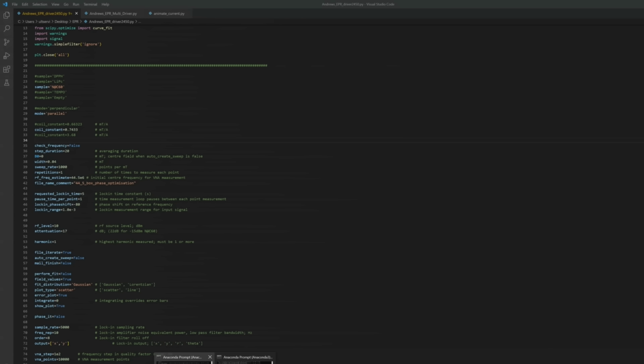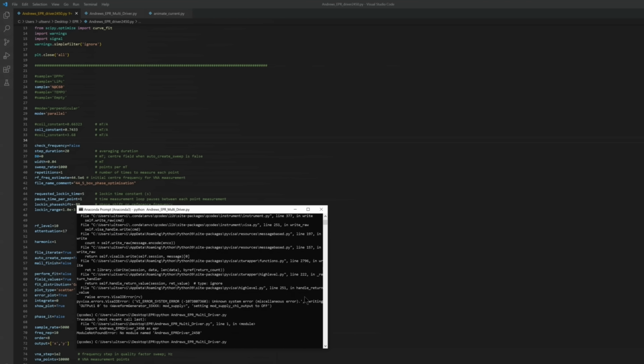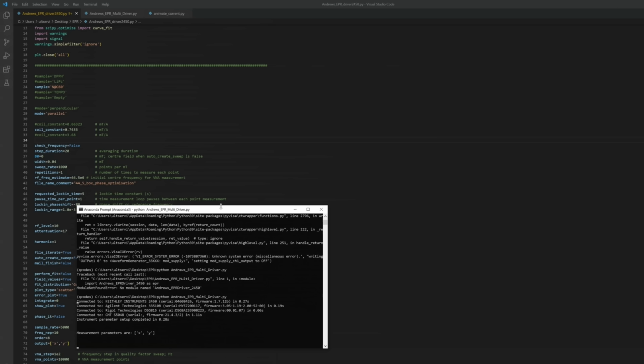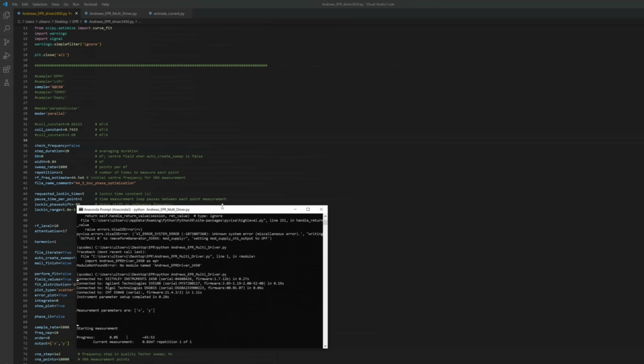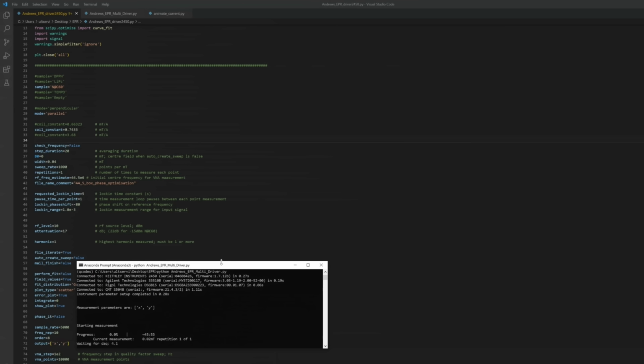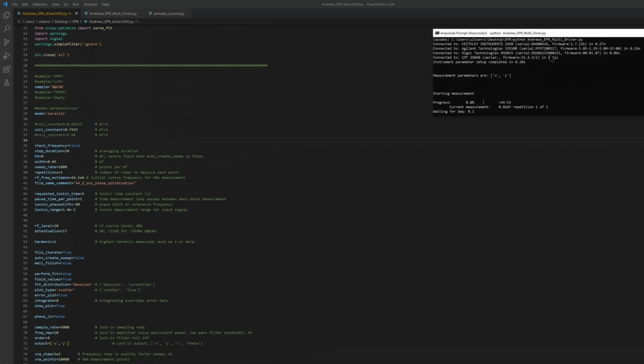So once our resonator is critically coupled, the frequency with maximum loss is passed via the Python script to our radio frequency signal generator, which then stimulates a sample at precisely that frequency. The next step is to run our script and allow the measurement to come in, and we can watch a plot of the measurement data in real time.